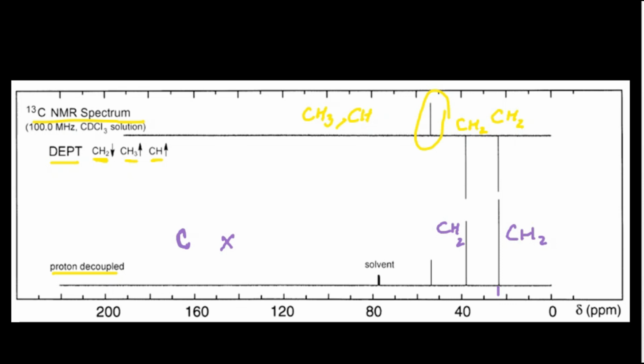Okay, now if you see the chemical shift values here, this is 0, 10, 20, 25. It means almost in the range of 23 to 25 ppm. So this is representing the presence of a CH2 group. Similarly, this carbon is also below the 40 ppm value, so it also represents the presence of a CH2 group. It may be possible that some kind of electron withdrawing group is present with it, because of which its chemical shift value is increased.